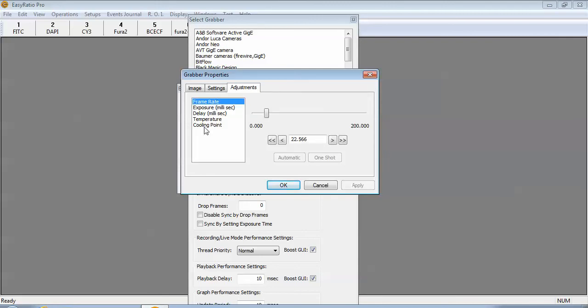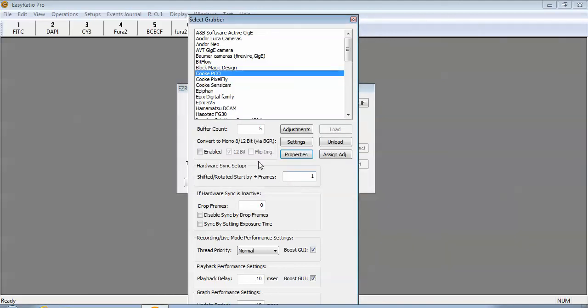So I'll leave all of these settings at the default values, and we'll map a couple of these parameters to our controllers. In order to do the mapping, I will discuss that in the next tutorial.